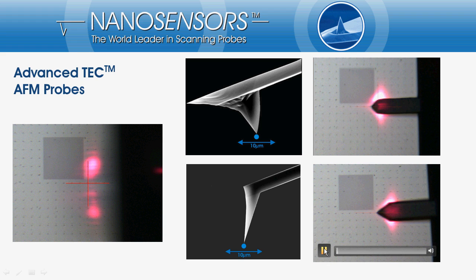If we now start the lower video we can see that when scanning with the Advanced Tech our point of interest is visible half of the time scanning. The scanning window here is pretty large, and finding things with the AFM tip gets more difficult the tinier our feature and the scanning window will be. Using an Advanced Tech probe will make life much easier here.